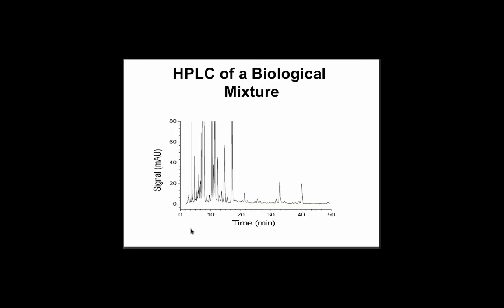So what can you normally get with respect to an HPLC or UPLC? This is an example of a spectrum that you can collect. In this case, it would be a UV absorbance. And you can see probably on the order of 50 or 60 different peaks. Some are big, some are small, and this emphasizes the huge range in concentrations that you'll see. Now, under any of these peaks, there could be dozens of small molecules. So even though you're seeing 60 or 70 peaks, there could be 600 to 700 different chemicals in this separation. Obviously, you hope you're lucky and each peak is a single molecule, but that's not often the case. So that's an example of liquid chromatography. It's a mainstay for a lot of mass spectrometry-based metabolomics techniques.